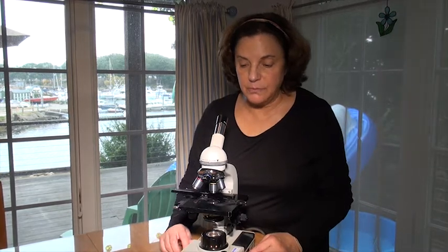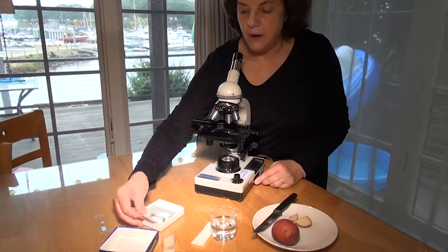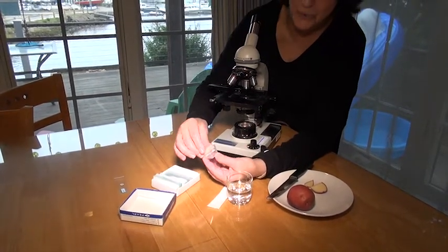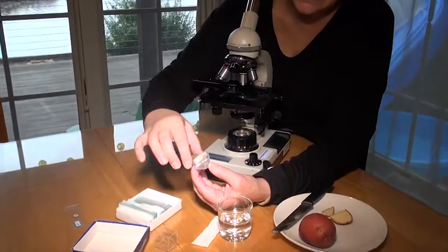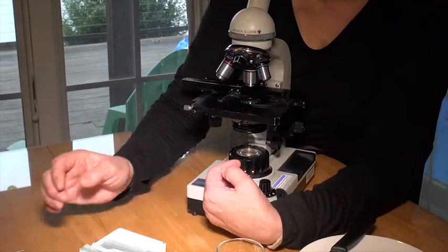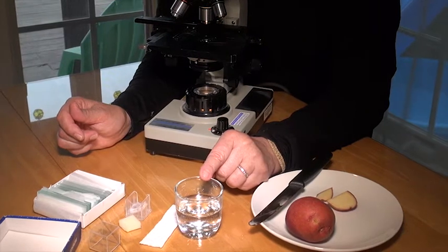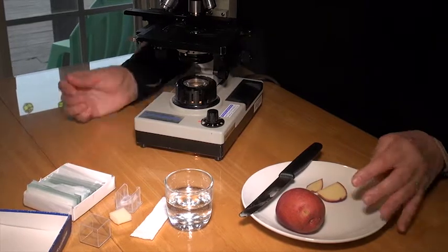The supplies we need for making our own slide are very simple. You'll be provided with a box of slides in your student black box. These are cover slips — they open like this. They're very thin pieces of glass, so use caution. You'll also have some water, normally in a dropper bottle. In my home situation, this is just tap water — no distilled, no 95% anything.